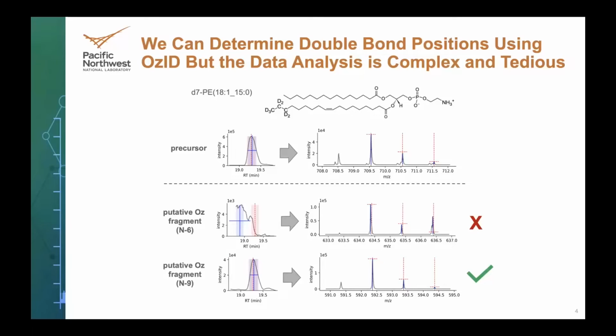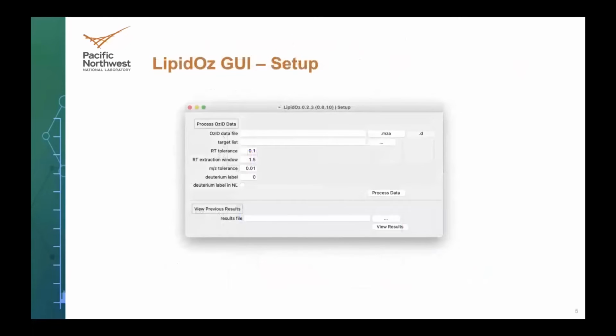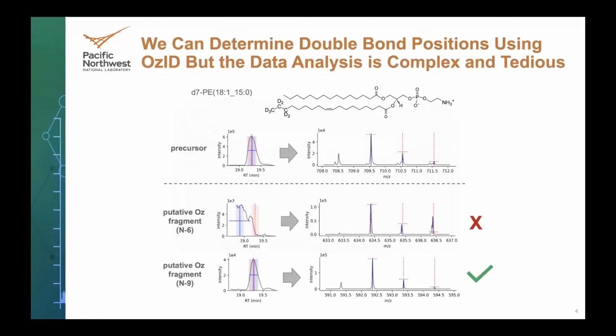So we set out to automate this process, and we did so using Python. This culminated in the development of a GUI application that goes through this whole process in a pretty automated fashion, with some minimal parameter setting at the beginning.